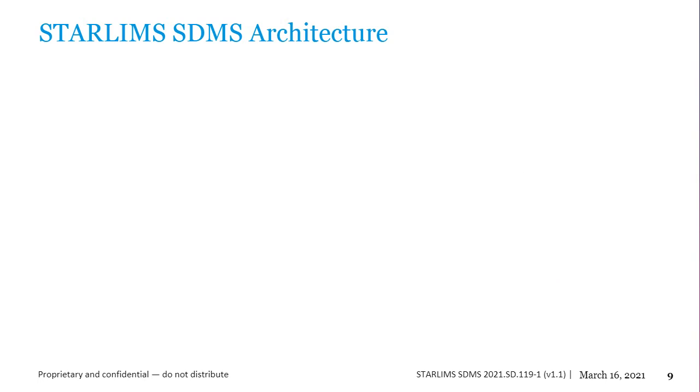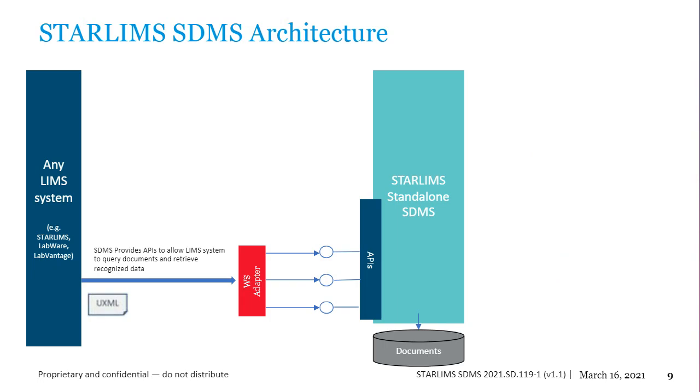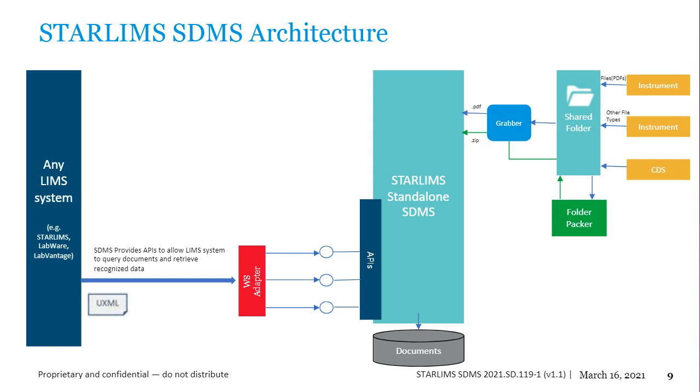Okay, thank you, Pradeep. So I'll talk a little bit about the STARLIMS SDMS architecture. In this diagram, I'll be covering different aspects of the architecture itself. As you can see, as part of the SDMS standalone solution, SDMS is in the middle of this diagram. On the right-hand side, you should see the various laboratory equipment that generates the final data to send to the LIMS. The purpose of this diagram is to show how SDMS not only captures the data from documents and various binary data files, but also acts as middleware for direct connectivity to your analyzers and all the other laboratory instruments. So let's work on the file integration piece.